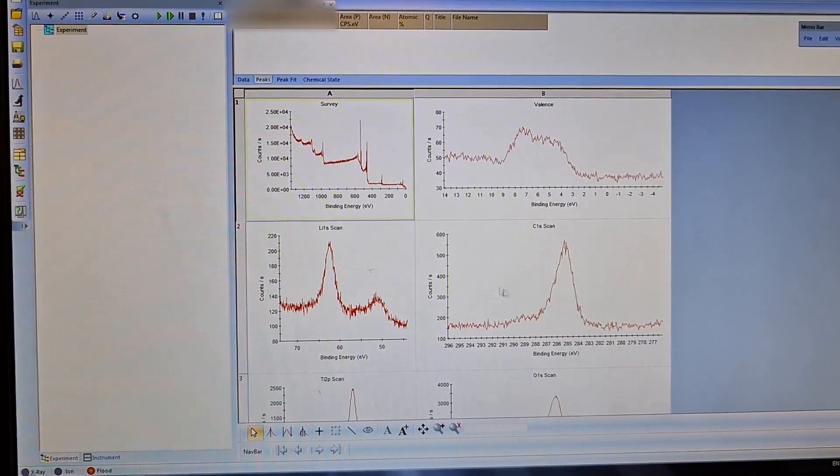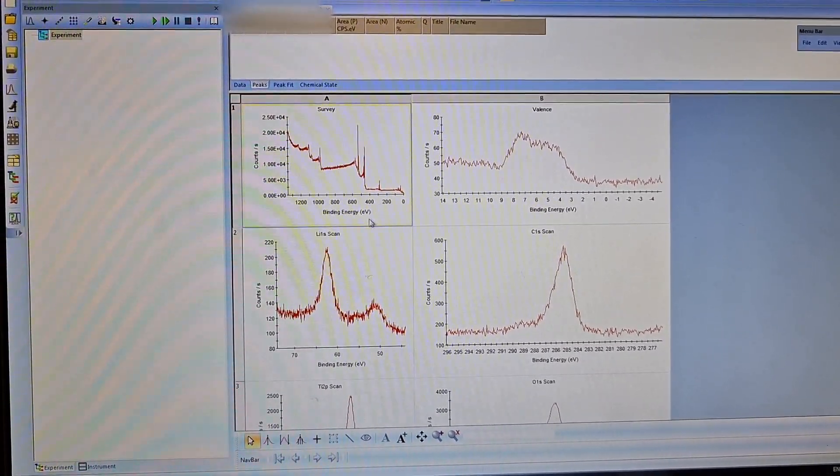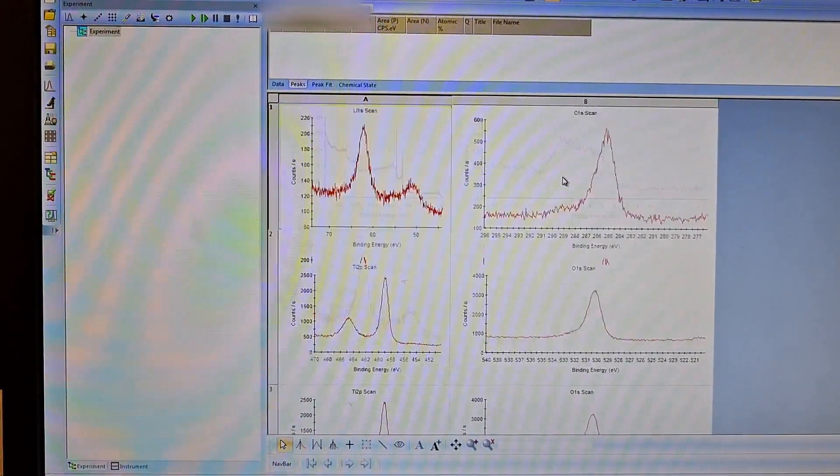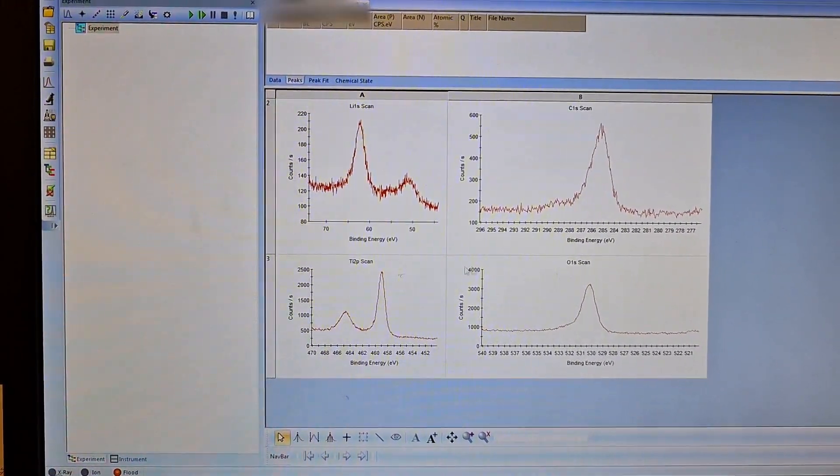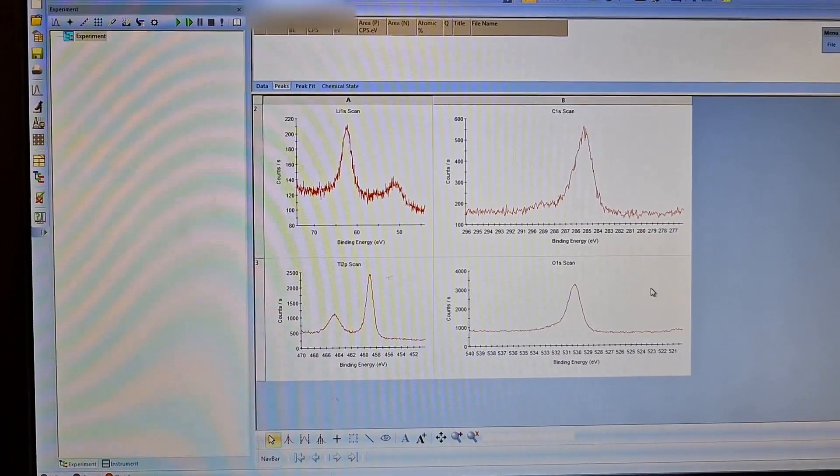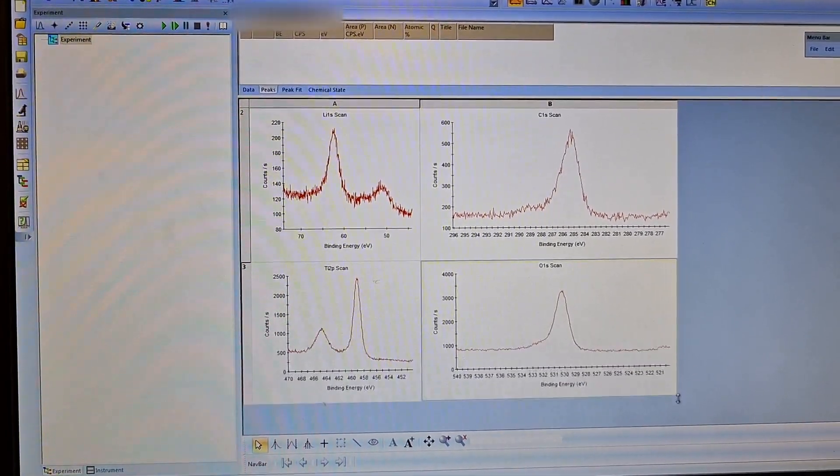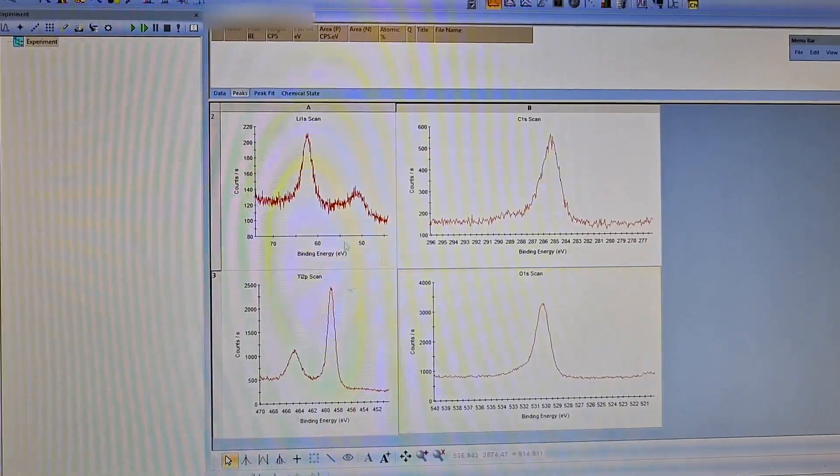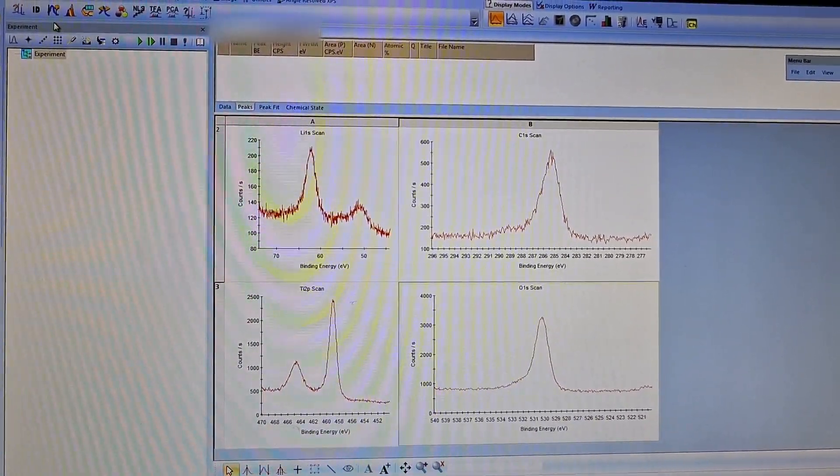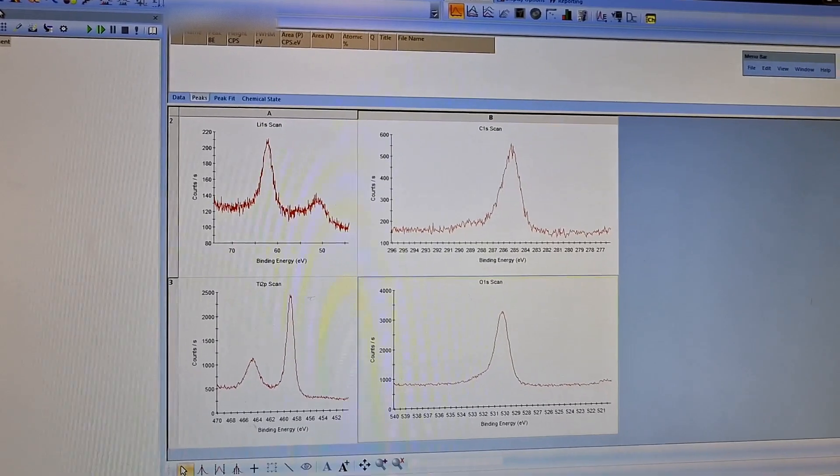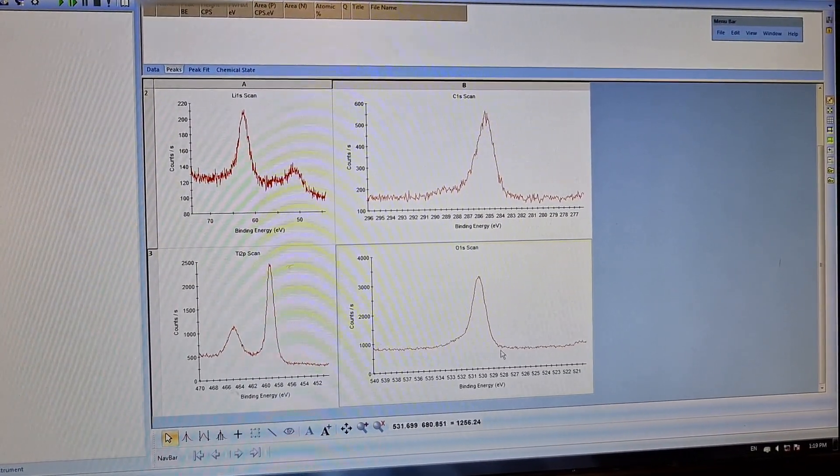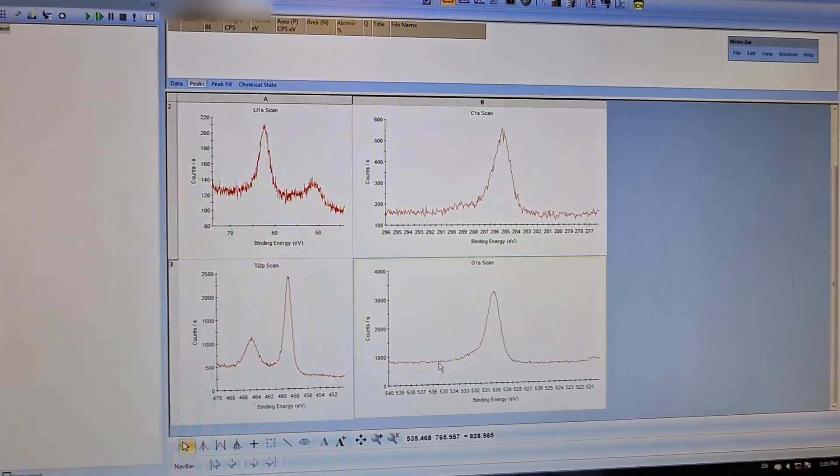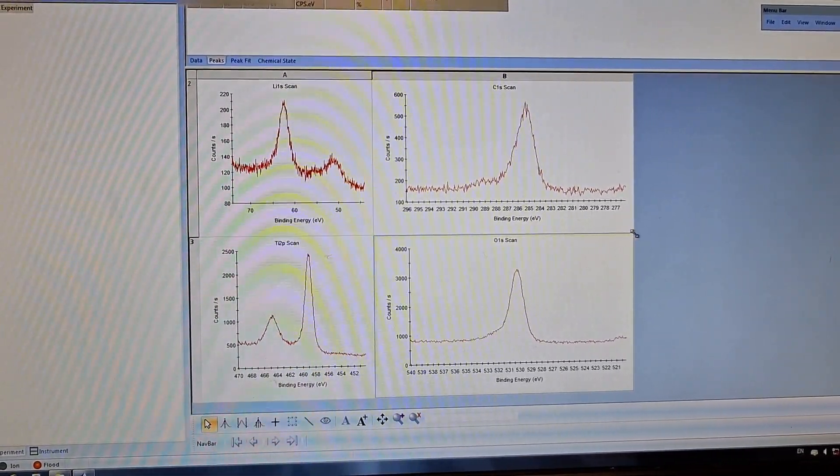We have other data: lithium 1s, survey, valence spectra, titanium 2p, and oxygen 1s peak. For fitting, I want to choose oxygen. It is relatively easier. Firstly, I have to add background from here to here, and I want to make it bigger.